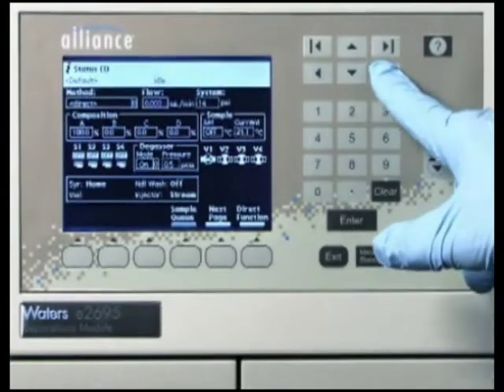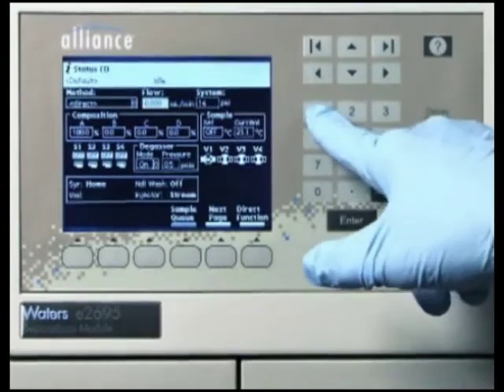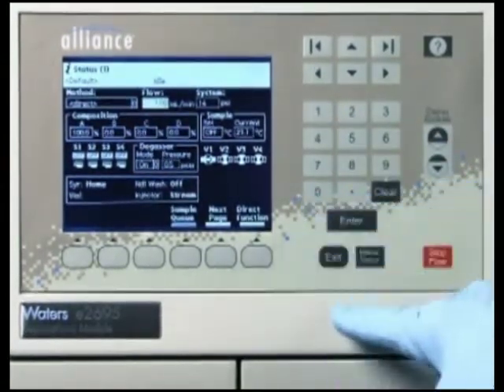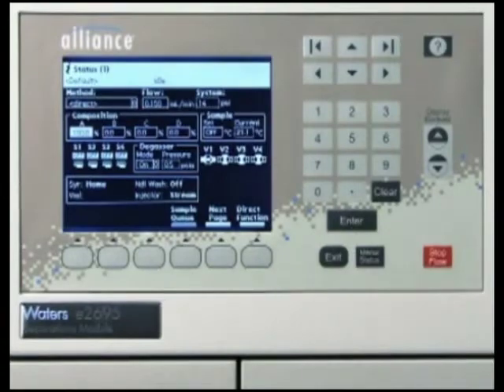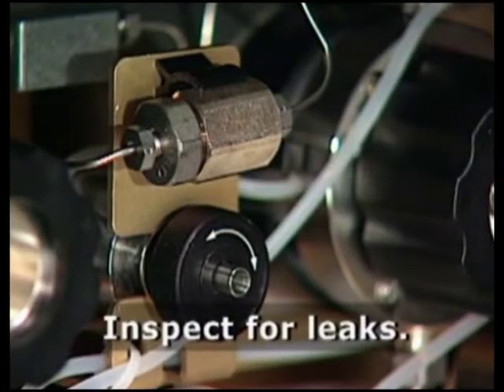After the inline filter is installed, enter a flow rate of 1 milliliter per minute and flush the system for 10 minutes. Inspect the inline filter for leaks and tighten fittings as required.